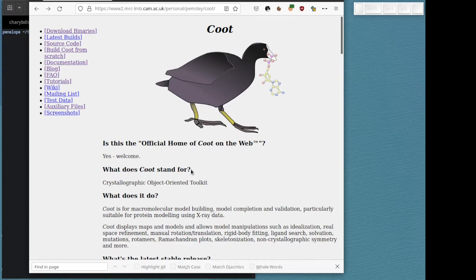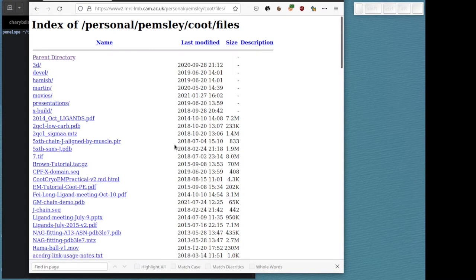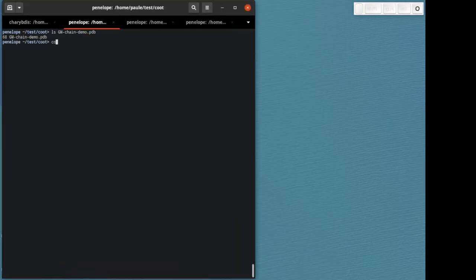You can find that by going to the LMB Coot web page and then going to auxiliary files, and then a file here called gmchain-demo.pdb. Download that and put it where you can find it. So I've already done that and it's here.